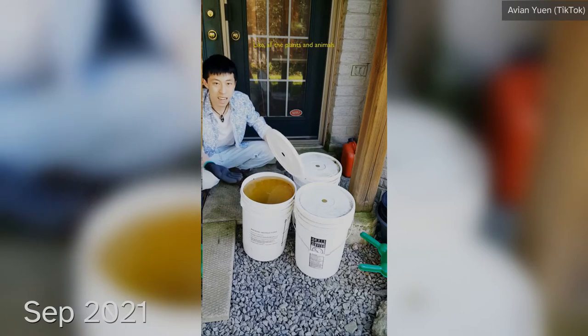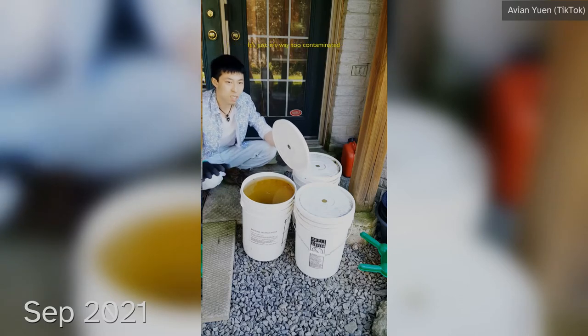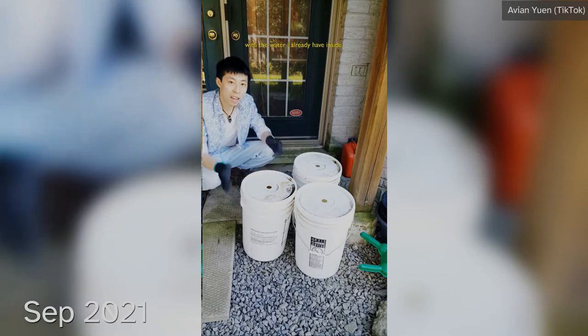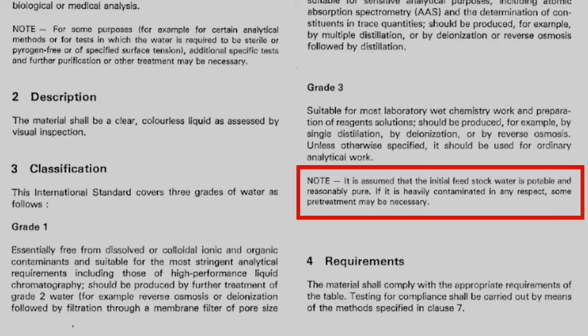Like, all of the plants and animals that spontaneously grow, it's cool and all, but it also gets caught in the filter and everything. It's way too contaminated. I'm just gonna continue with the water I already have inside. So now the water is way too dirty to do this. At this point, I would need to do multiple distillations to clean the rest.